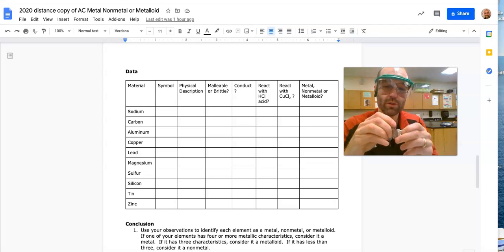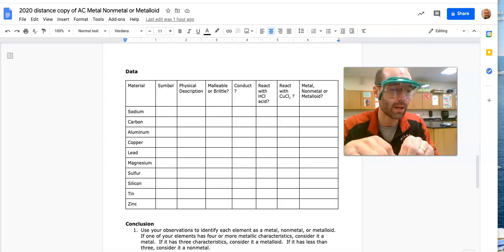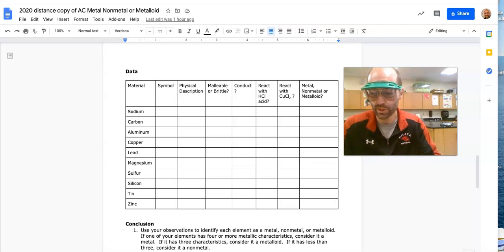If you have ever used any fishing weights with lead, you've maybe noticed they're malleable because you can use pliers, or I sometimes use my teeth, even though I shouldn't, to put those sinkers on your line or to take them back off. And you're actually bending them when you do that. Whoops, I just tore some.